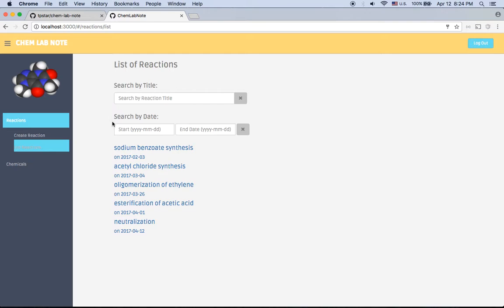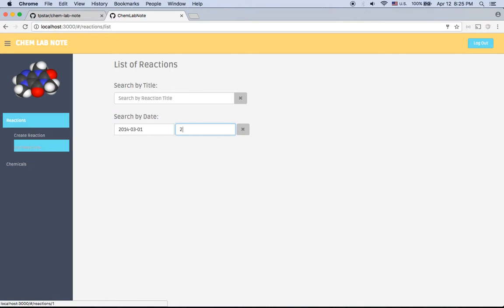Now let's say you want to find the old records and you cannot remember the exact title or when you did the reaction. But you know that the reaction was done in, let's say, March. So you provide the range of date.